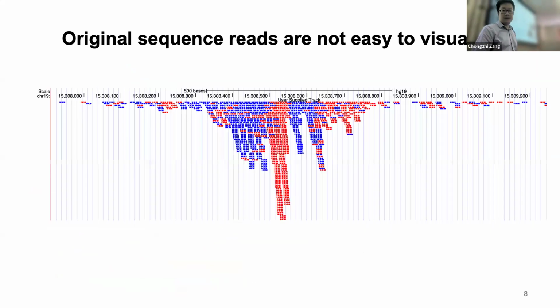So this type of picture, this type of pattern just means that there are a lot of DNA sequences, right? Some sequences, you have their 5' end reads mapped to this position. Some of them, you have their right ends. So this is from a single end sequence, so we don't guarantee that we have every sequence read that has its corresponding end. This is just what people usually observe. It can be very messy, can be noisy, but we can see both the sequences can be mapped to either way.